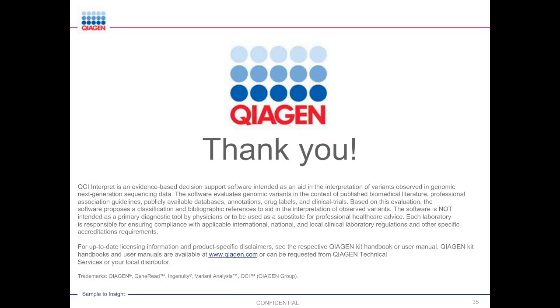So the gene identification can be very quick. What takes the most time, and runs without any manual hands-on from you, is the variant calling part. And that depends on the hardware you run the software on. If you have really fast hardware and a very good disk, you can run that extremely fast.